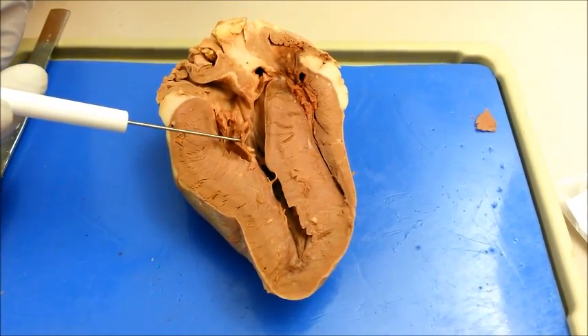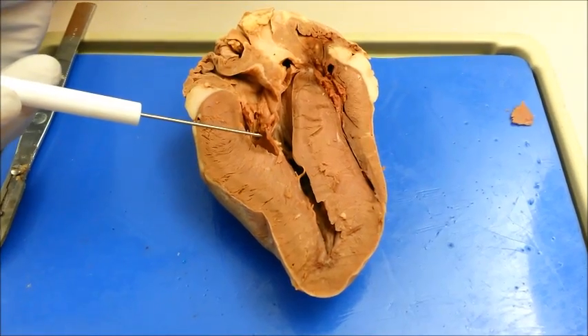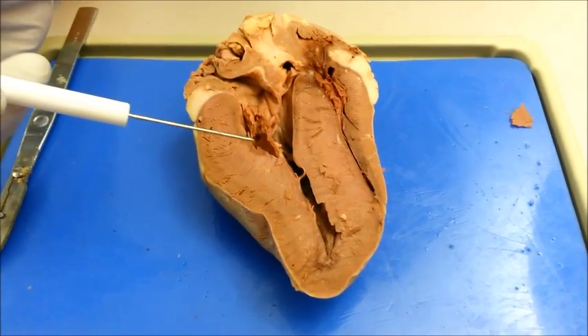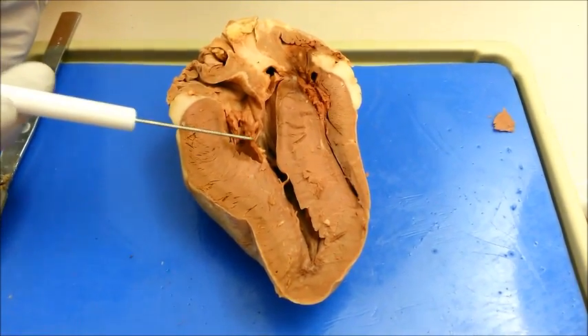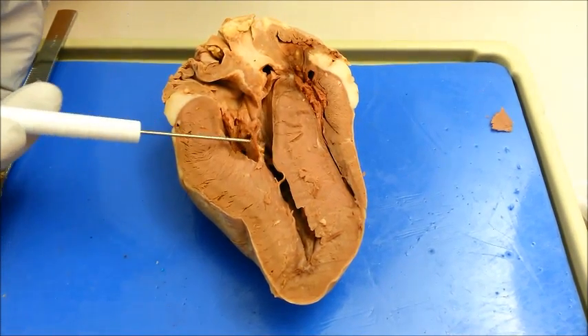The chordae tendineae, also referred to as the heartstrings, are fibrous cords that connect the bicuspid and tricuspid valves with papillary muscles. They stop the cusps, after they have closed, from swinging back into the upper chamber of the heart.